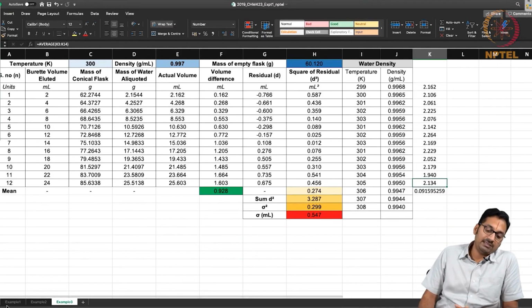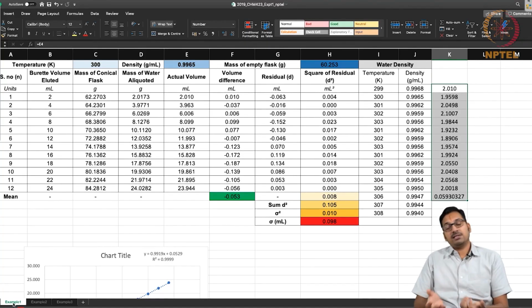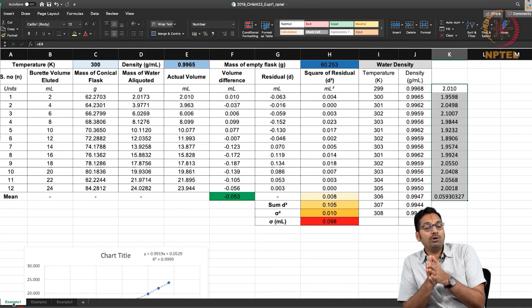So you would want to mimic the scenario of the first researcher by making sure your experimental setup is done in such a way that no systematic errors crop up. Okay, in this experiment what we saw so far is how to use software, in this case a simple spreadsheet, in order to make an analysis and try to see whether you do get systematic errors.